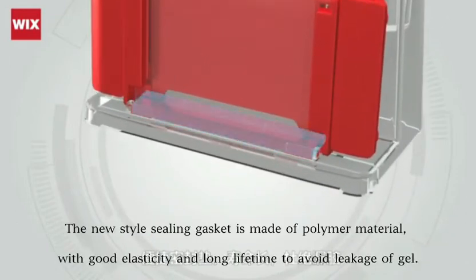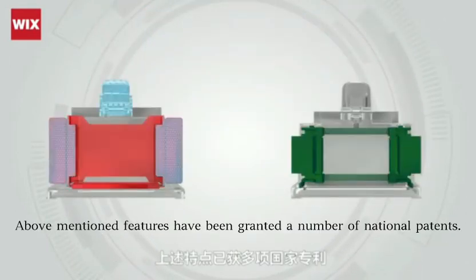The long-lifetime sealing gasket avoids gel leak. A number of national patents have been granted for these innovations.